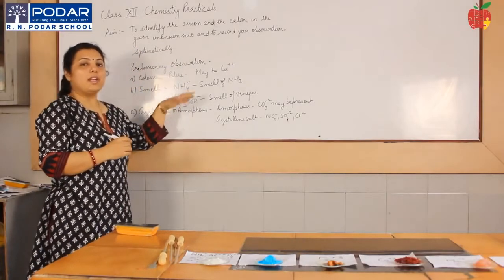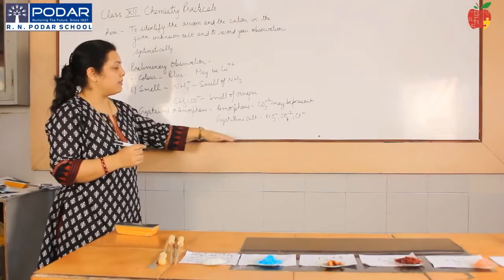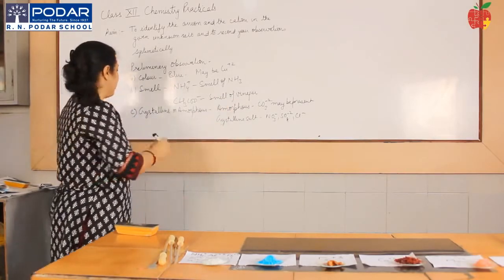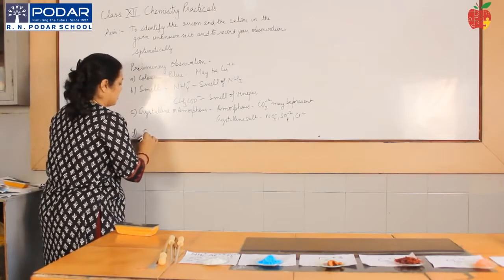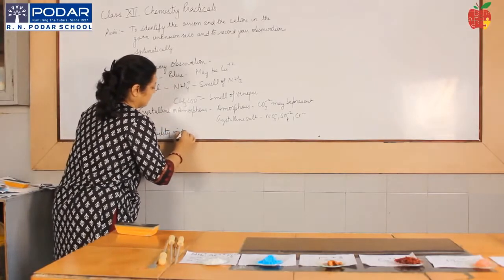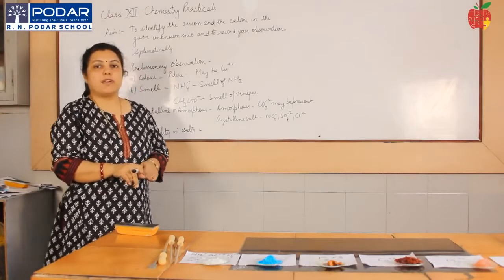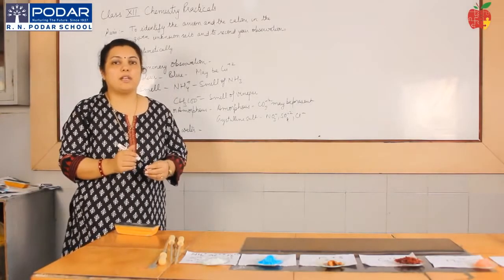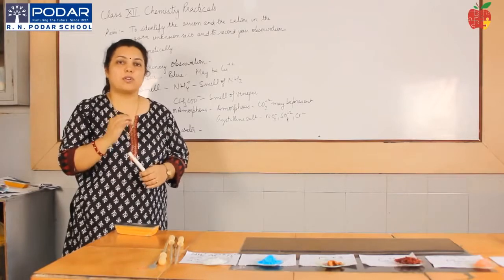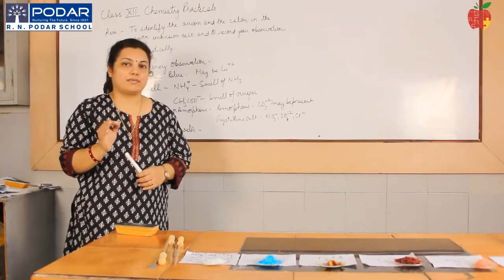Now this is only certain hints to tell you what it can be. You can't say something which is crystalline has to be nitrate or has to be sulfate. This is just a guideline. And the last thing that you see is your solubility in water. Now most of the salts which are provided to you are soluble in water. Water insoluble salts are no longer in your syllabus, so the salts which we provide you should be soluble in water to a large extent.